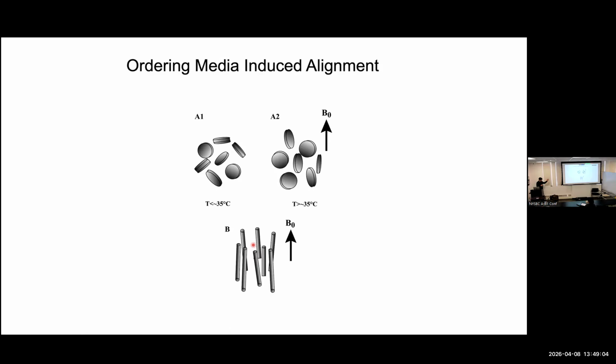But by simply having a wall that's aligned, if I now add bicelles or add phage, I basically enrich my sample with walls. And if I have lots of walls, through simple steric interactions, what would be a bad molecule that is never going to align? What property would it have?